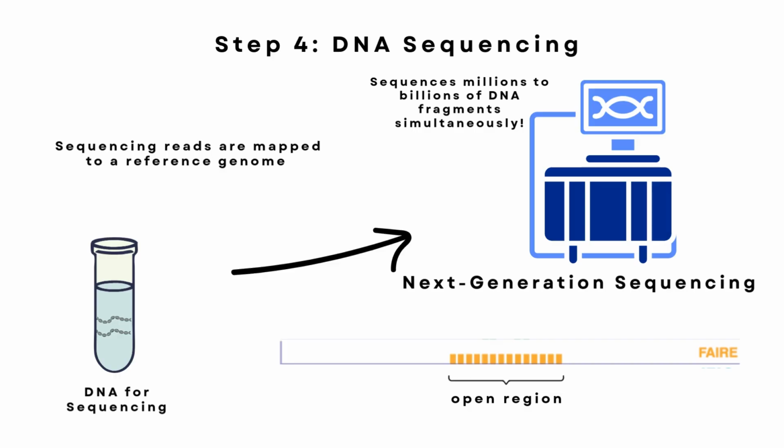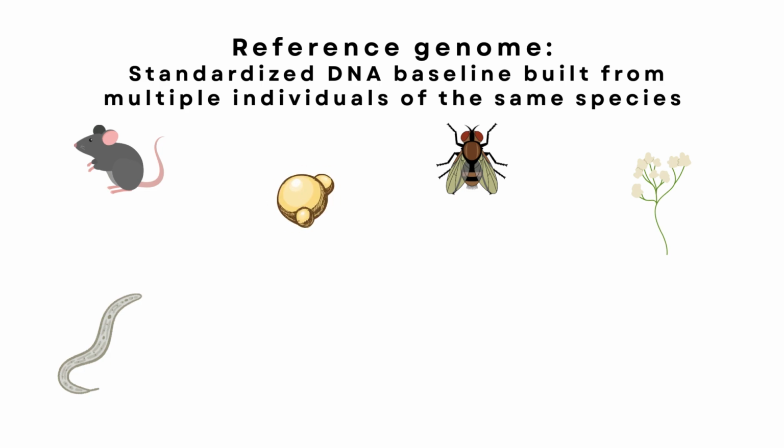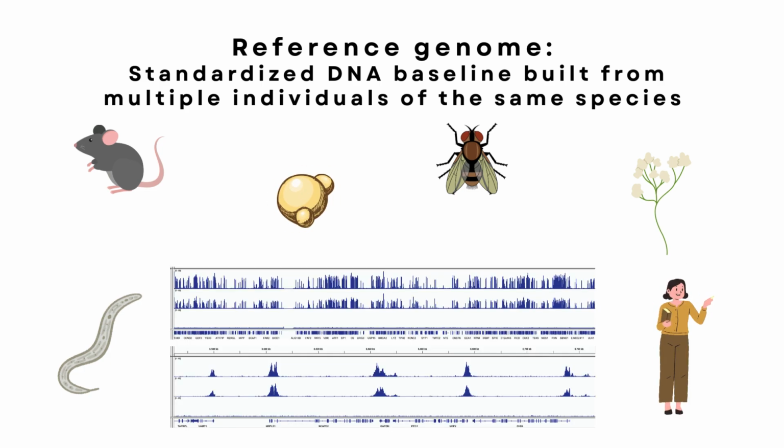Sequencing reads are mapped to a reference genome, which is a standardized DNA baseline that's built from multiple individuals of the same species. This can allow researchers to identify regions of significance that correspond to open chromatin.